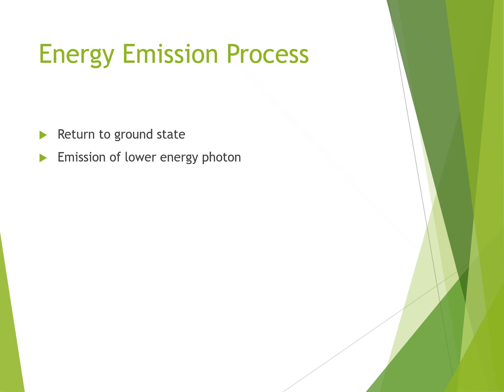So, it is discussed that when a photon is absorbed, the electron becomes unstable, the molecule is in an excited state, and it wants to become stable. Some of the energy is utilized in vibrational relaxation, and then the emission occurs.